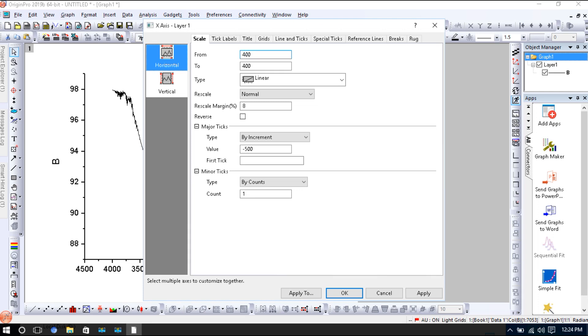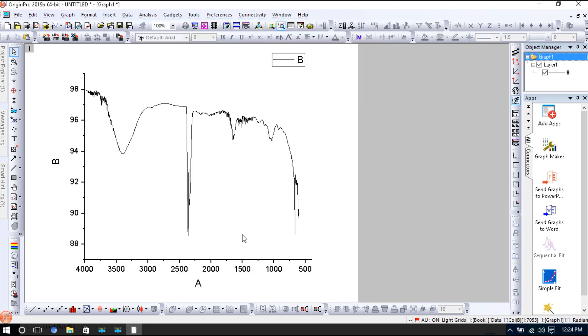Look at this, my FTIR data is plotted. And if you remember, there are two regions: the fingerprint region and the functional group region. These you can identify.